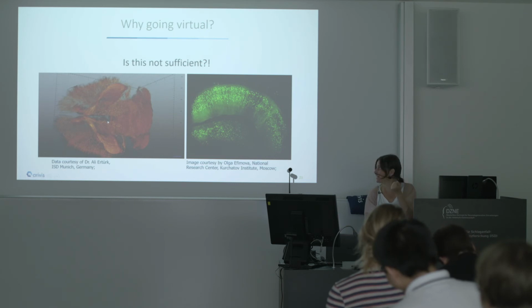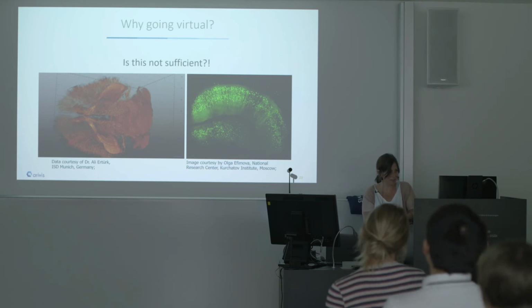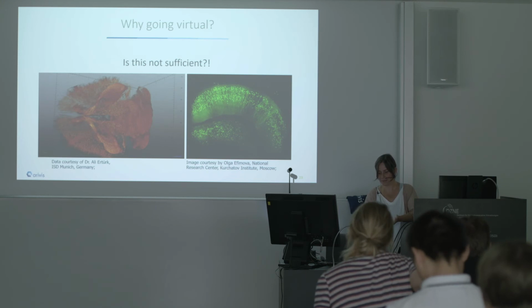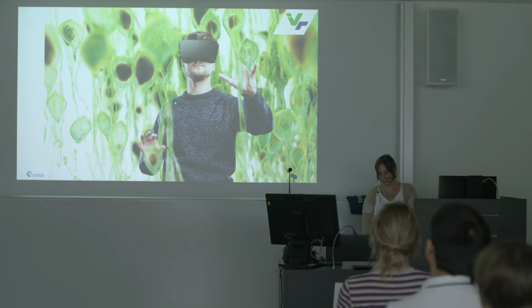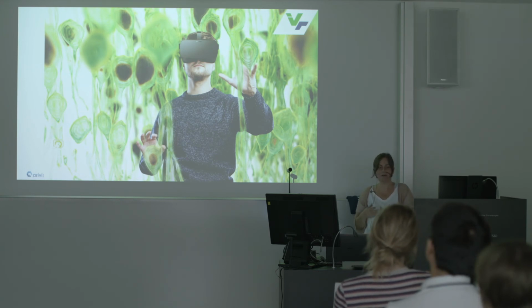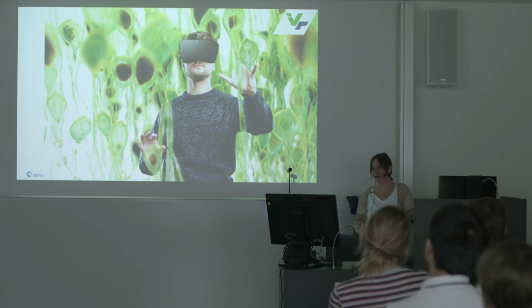It's a brilliant screenshot, and if you look at it on a 2D screen, it will also look lovely, but you're still blocked by the screen, basically. You're still flat in your perception. And that's why, about three years ago, ARIVIS started to develop an individual application using our core technology, applying special rendering techniques to show a microscopic image in the virtual reality world, so that you really immerse.